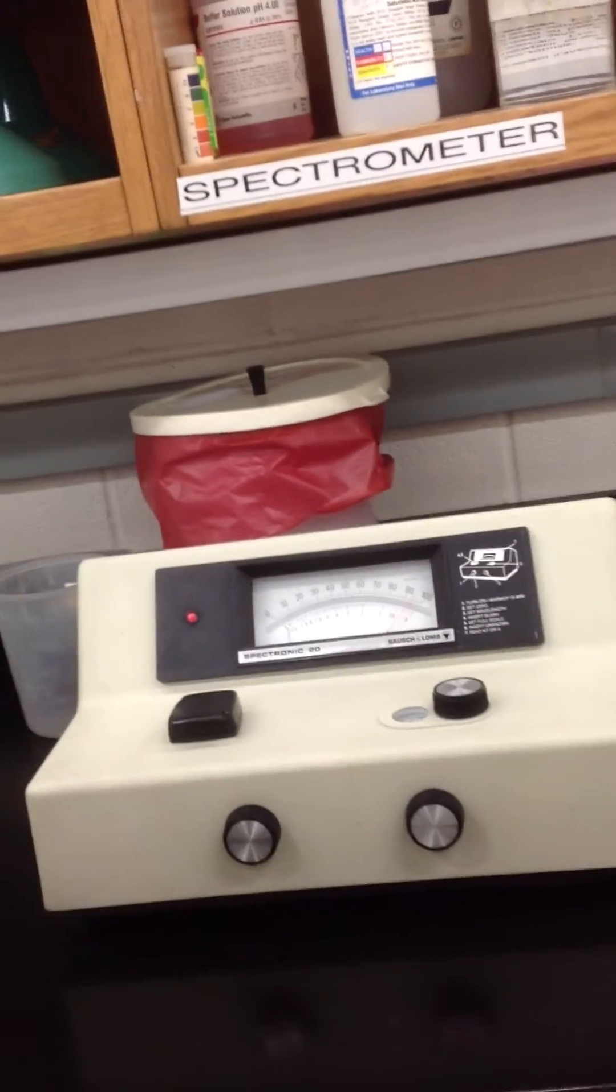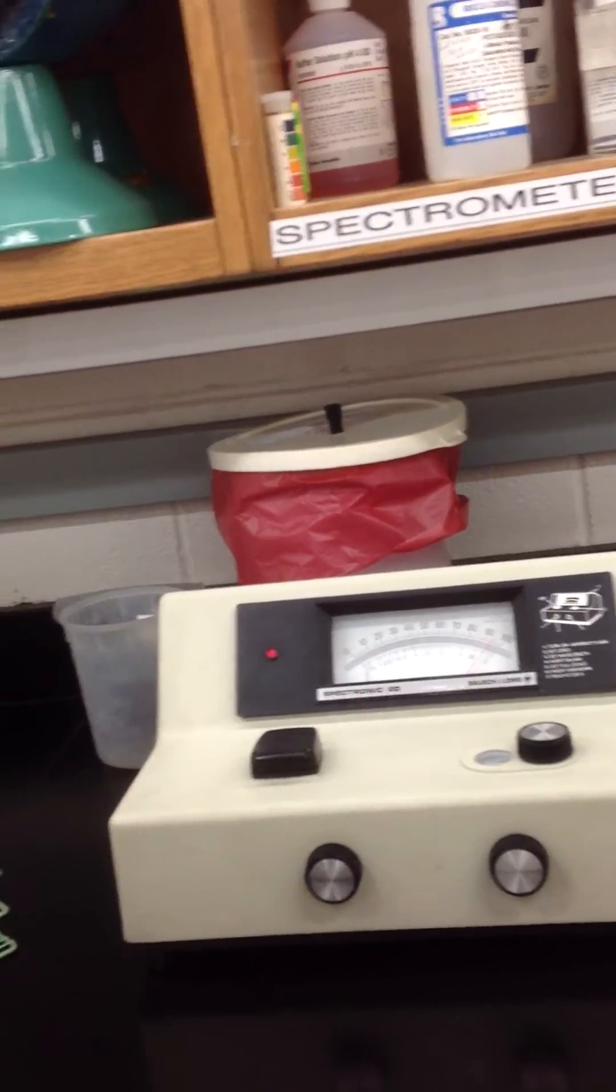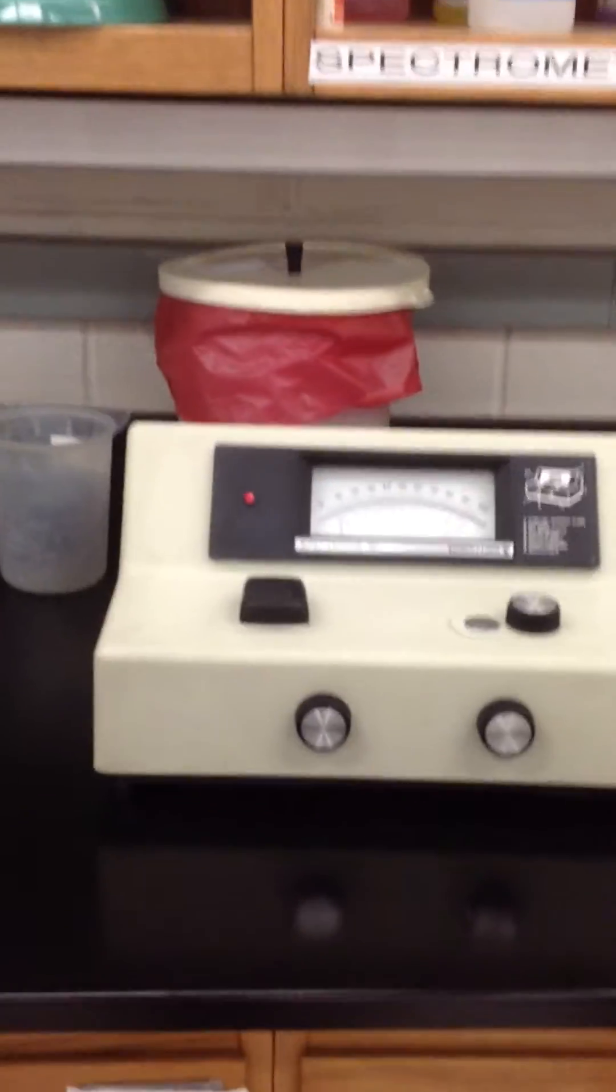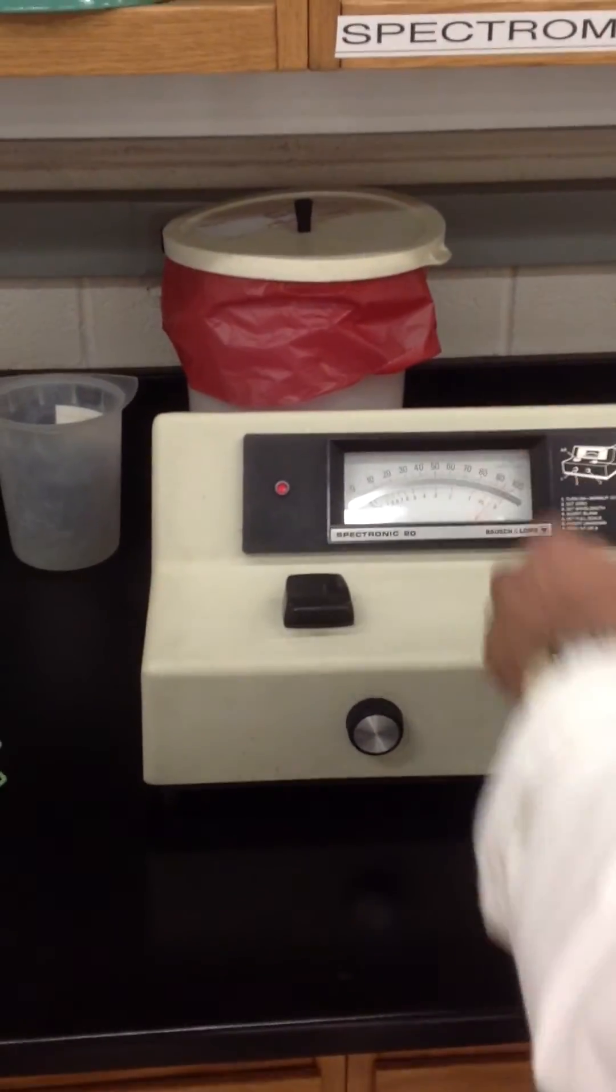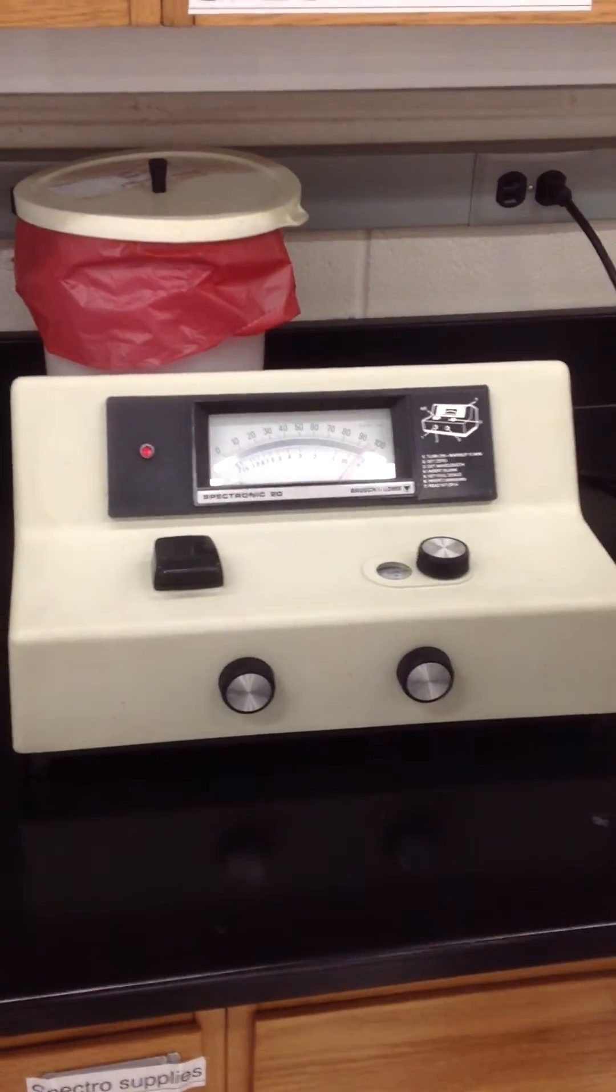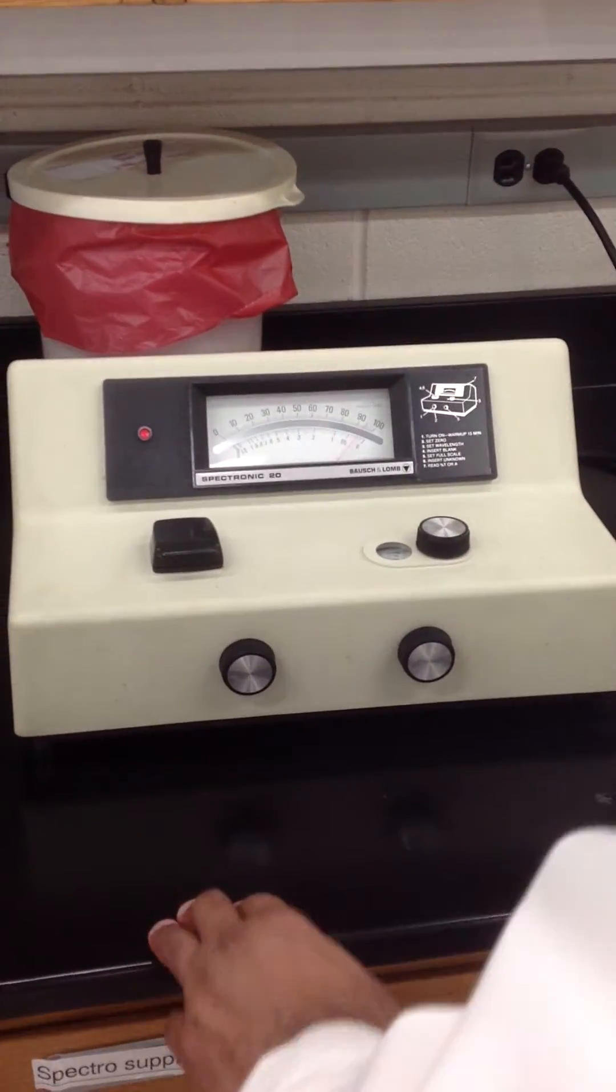Zero point two. Point zero two five. Point zero two five. Yeah, you're going to read it in between. It's actually 0.025. So it starts from 0.01 to five, and then to 0.1 and so on. So if it's in between, you try to round off as near as you can.